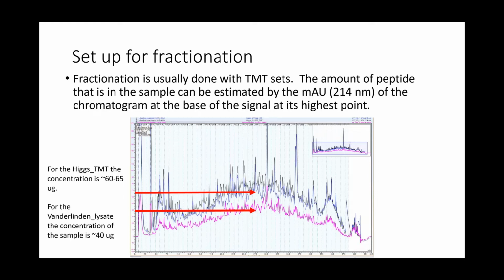And so we have over the years developed a way of being able to quantify the amount of peptides that we get. So all the way back in the protein BCA, when we tried to quantitate the proteins, when we started with our initial cell pellet and we made our lysate, we did a protein quant. That's where we started with the amount of protein. And then from that point, we went through reduction and alkylation, and we desalted and digested and desalted. And so there's quite a bit of loss at some of those steps.